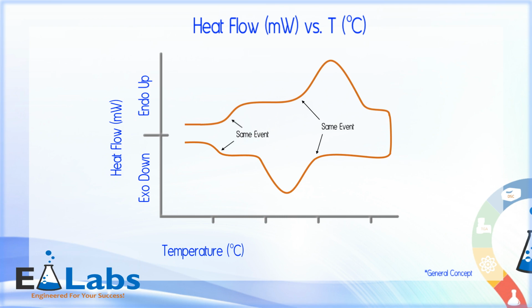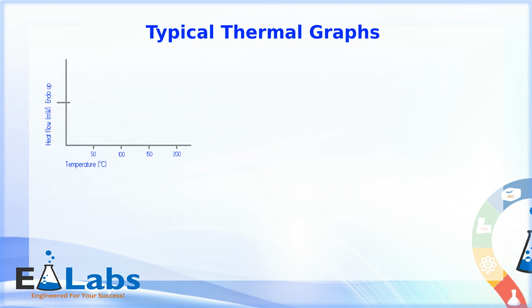This is a generalization, and many will not look so nice. Yet, through this hypothetical generalization, we will make sense of comparing opposite properties such as melting and freezing, or glass transition and crystallization, correct? With this understanding, then, we can understand the basics of what a heat flow graph visually represents. A visual look at the graph always reveals the type of thermal transformations that have taken place. Thinking along those lines, let's look at a few typical thermal graphs. Can you guess the transition before it's revealed?